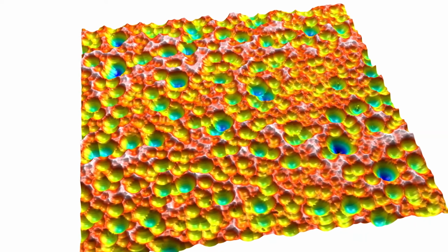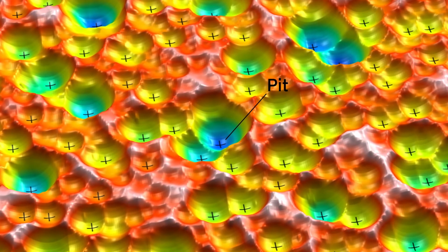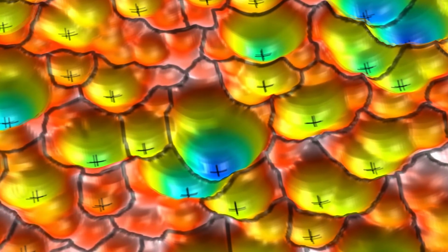In cases where you have aggregated particles or holes, the threshold detection will often fail, in which case we recommend the use of the watershed segmentation. If we focus on valleys, also called dells, for the moment, watershed segmentation detects local minimum points called pits. In this 3D view, you can see the pit points at the bottom of the valley. The ridge line in black separates the valley from its neighbors.